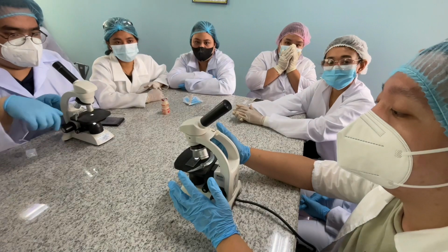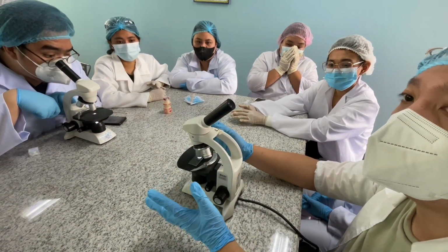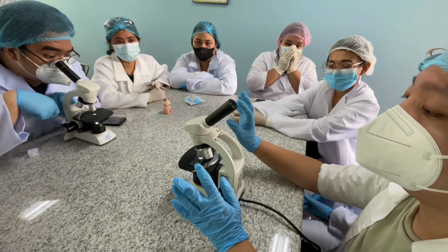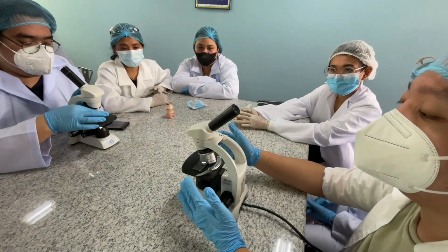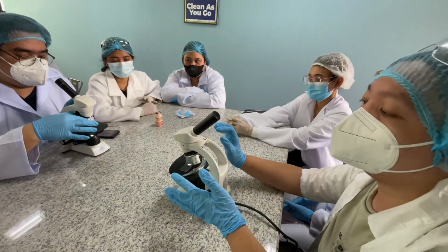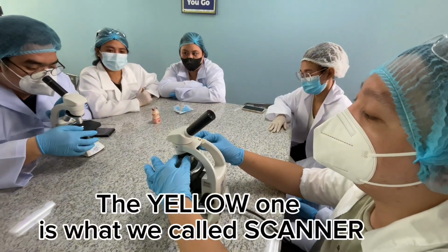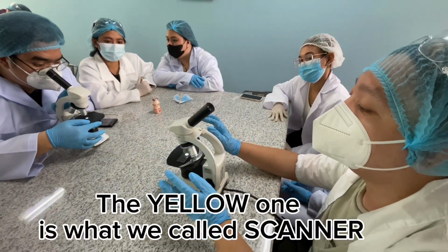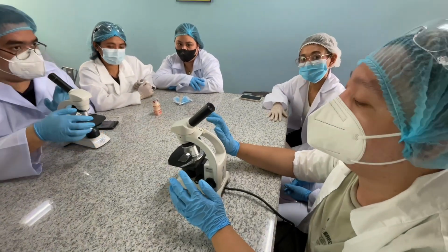This eliminates air when it comes to our specimen, especially for those specimens na medyo sobrang gaan nila and possibly mag-move. So to make sure na stabilize din yun at mas mabilis natin makita or to find what we're looking for sa ating specimen. And then of course, we have here the yellow one, our scanner. The scanner is what we use regularly and for general use, for at macro level naman siya.